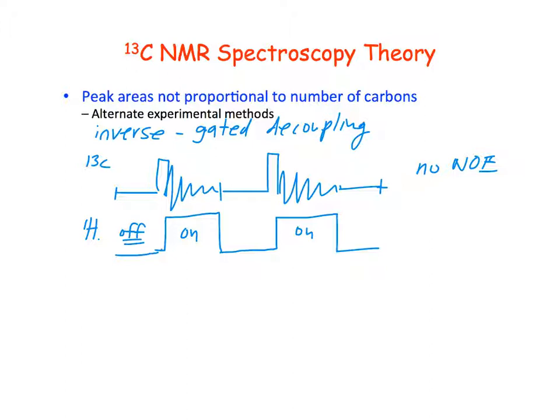What about coupled versus decoupled? Is the C13 spectrum going to be coupled or decoupled? Decoupled, because we have the decoupler on during acquisition. So all you're going to lose is the NOE, but still have the decoupling. Right. If you did it opposite, you would have coupling. Yeah, that's the next one we're going to draw out. Yep, exactly.